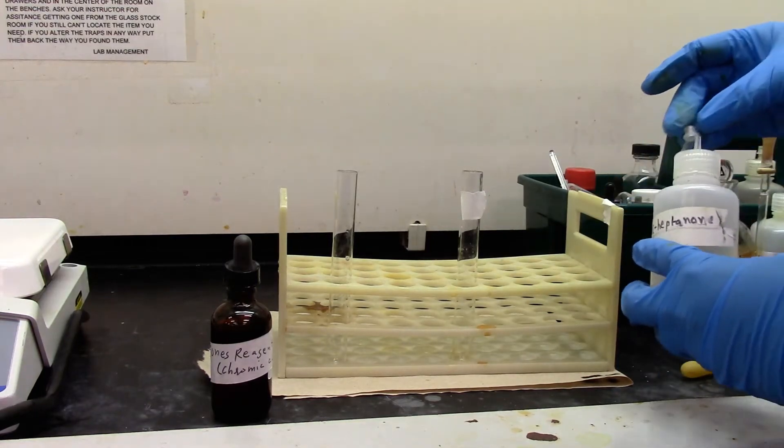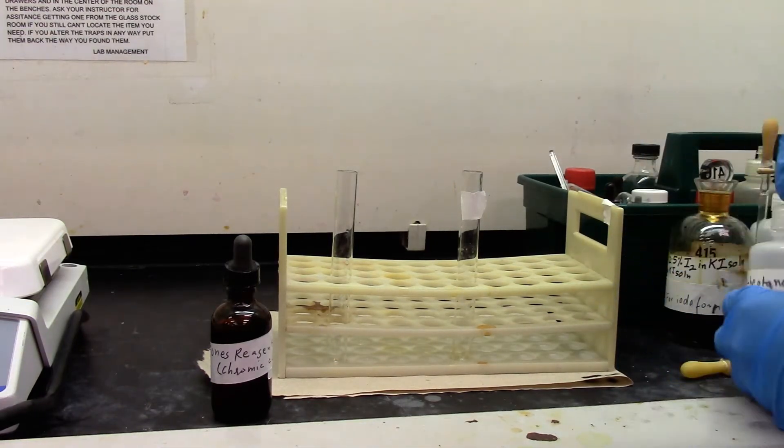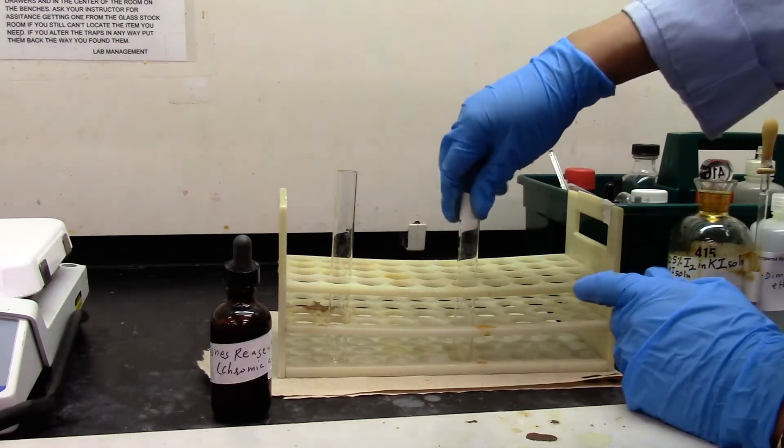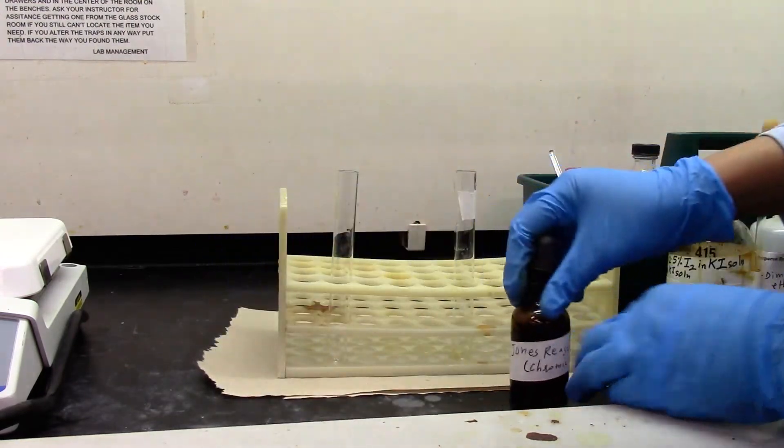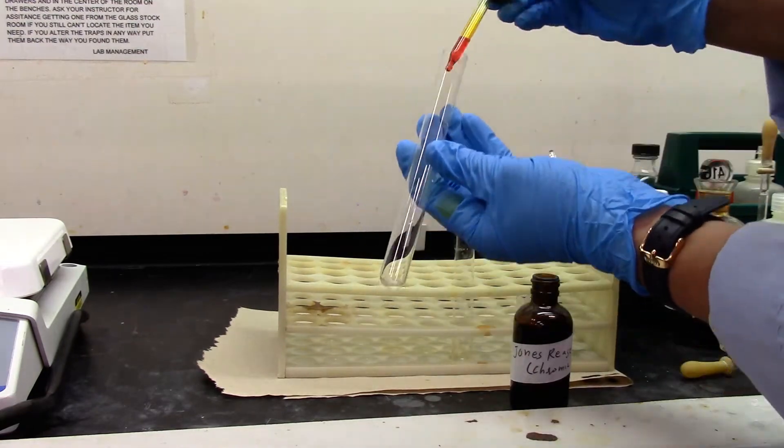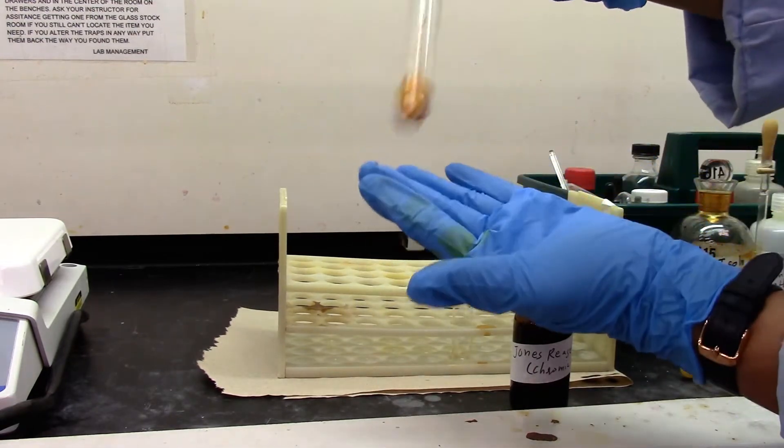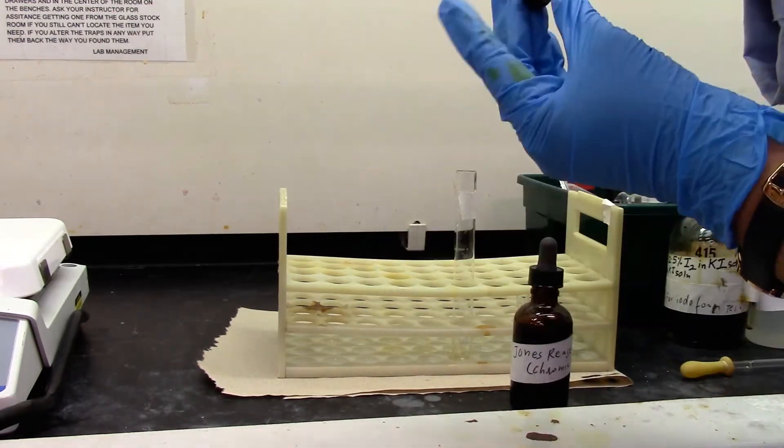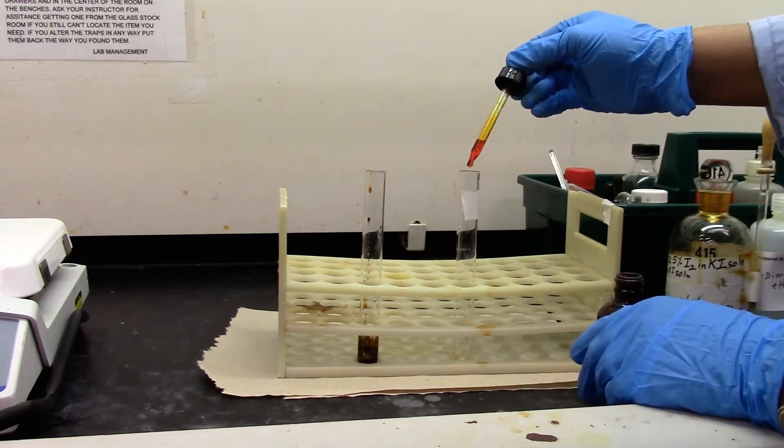Heptanone, which is the ketone, is my negative test. Jones test only responds to aldehyde, so this should be my negative test. Now I am going to add a few drops of Jones reagent and give it a mix.